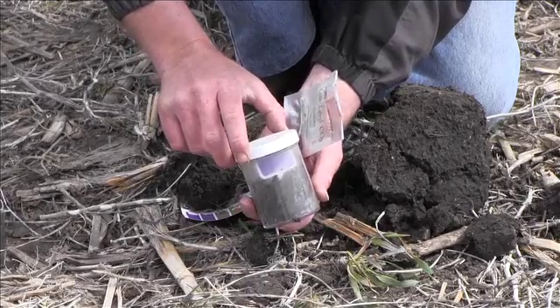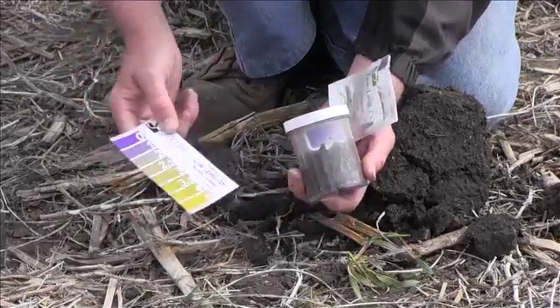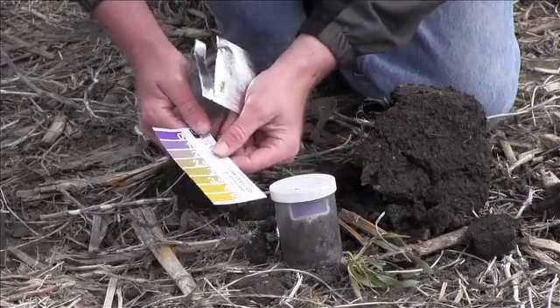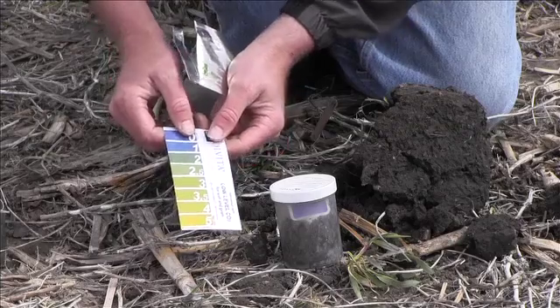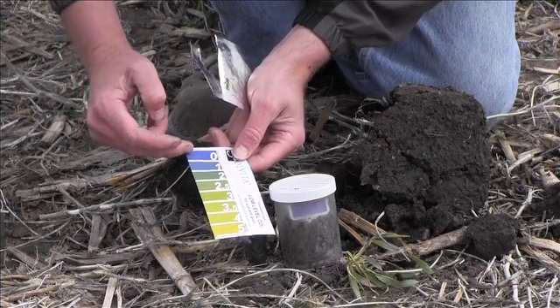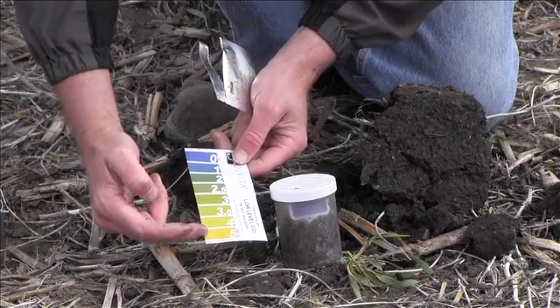The Solvita Test takes 24 hours to complete. Once you have the lid on the jar you can take it back to the office. You have a color chart that shows an incandescent color chart and a fluorescent light color chart. It goes from high activity to low activity, and the best activity for the soils would be in the middle of this color chart.